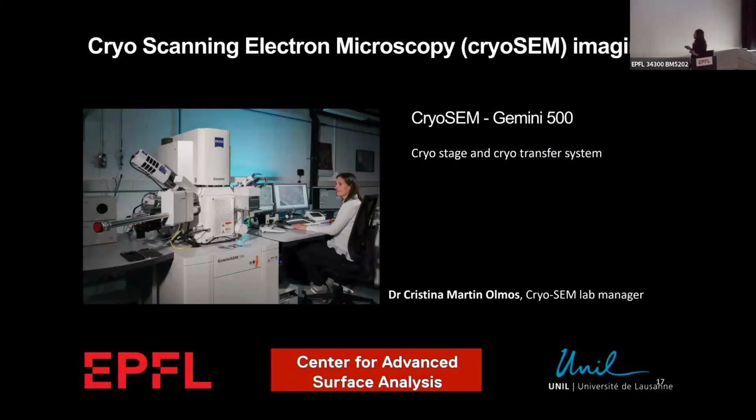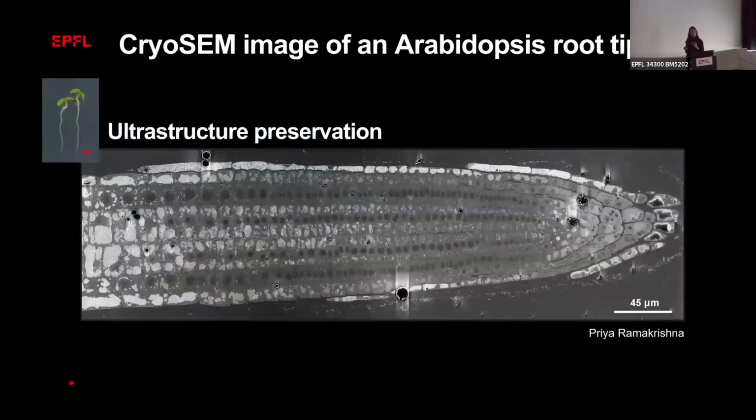I show you now one of the first images of the Arabidopsis root tip in its most pristine state. I hope you can appreciate that this is a root tip that has not lost any of its compounds. You have not put any stain on the sample, and you're looking at a neat slice right through the root and looking at the different subcellular structures. All of these little dots that you see are nuclei, for example, and these little whitish looking structures are vacuoles. You really have a well-preserved root now with all its constituents nicely maintained in place.